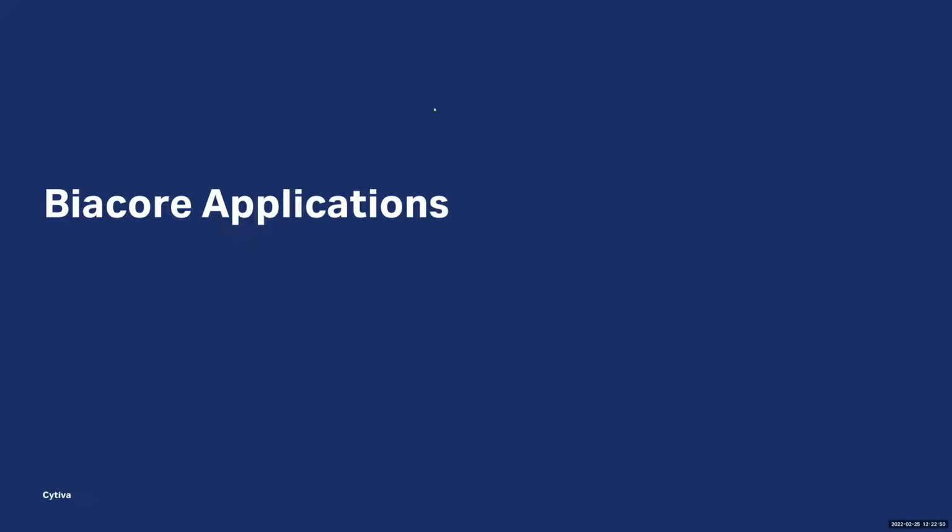Okay, if you want to identify binding partners of a specific known protein, but we don't know what we're looking for as a binding partner, then it is possible to use this. On the Biacore T200, yes, there is a binding partner recovery mode. You can take an unknown mixture, inject, measure binding, wash the surface. As long as dissociation rate is not very fast, you can then regenerate and recover the bound material, take it to a mass spec for identification. There are some papers that have described this in the literature. I won't say it's been a huge Biacore application over the years, but there are probably between 25 and 50 papers where this has been done and described.